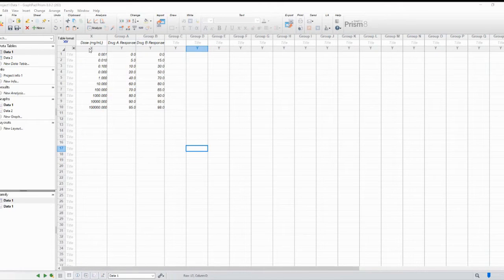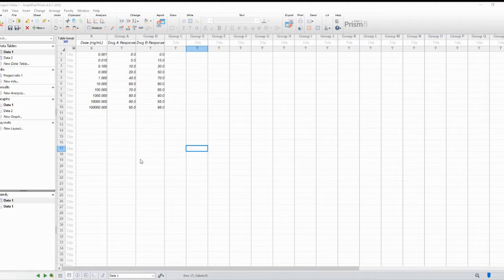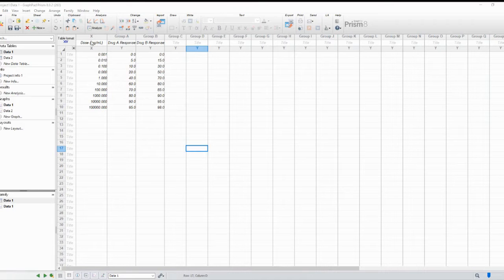GraphPad Prism provides a spreadsheet-like interface where you can input your data. Make sure your data is organized correctly, with one column representing the doses and another column containing the corresponding response values.